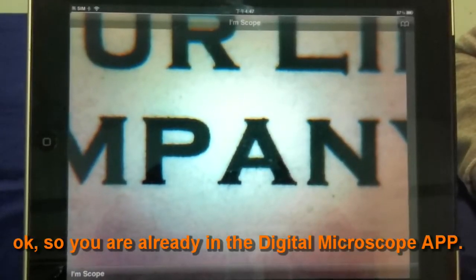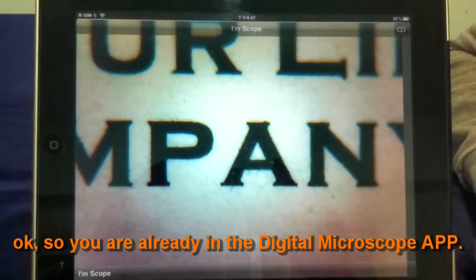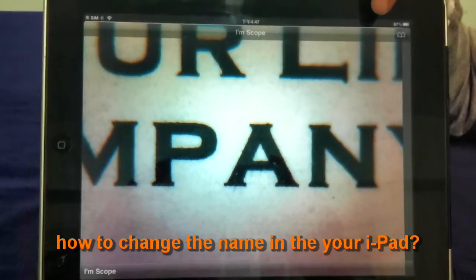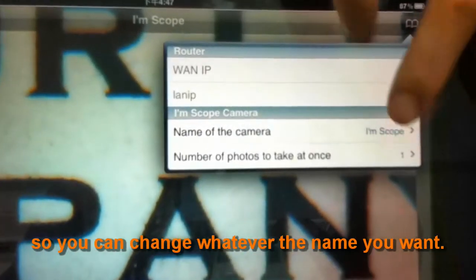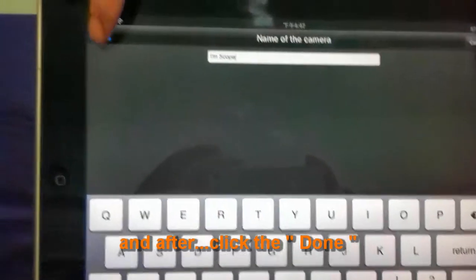Now you are in the digital microscope app. How do you change the camera name on your iPad? Click here — this is the name of the camera. You can change it to whatever name you want, then click done.